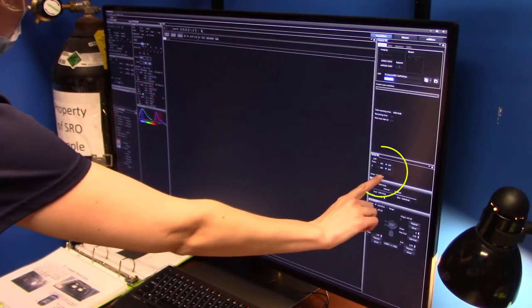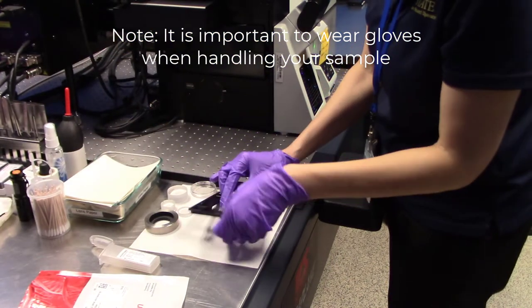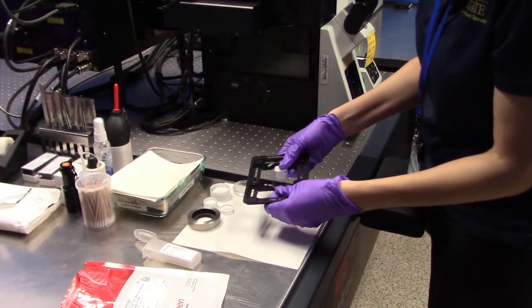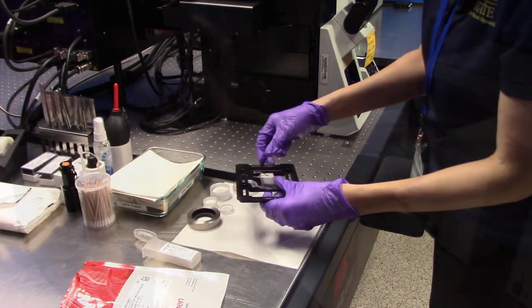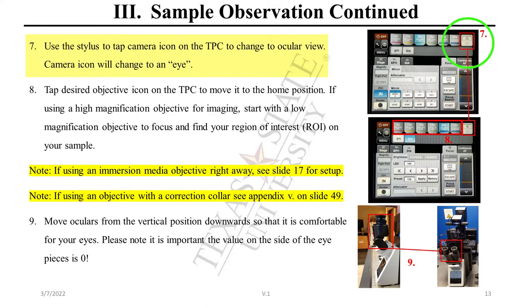Next, verify time and Z series are turned off, turn off the room light, and put gloves on. Samples must be loaded upside down or positioned in a petri dish with the correct thickness because this is an inverted microscope. Use the stylus to tap the camera icon on the TPC to change to ocular view. The camera icon will change to an eye.